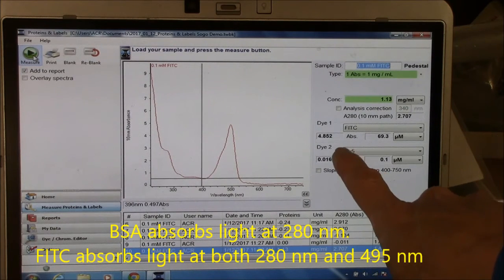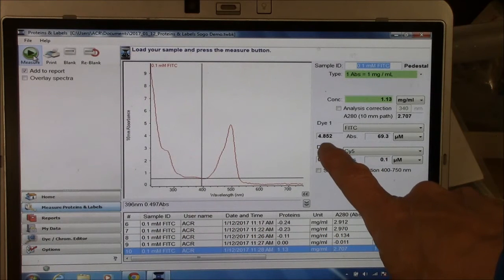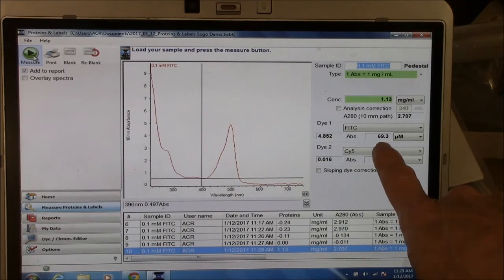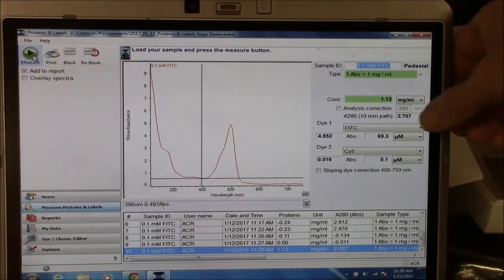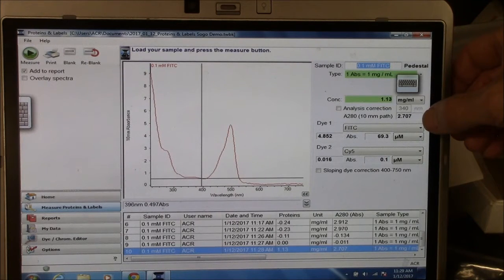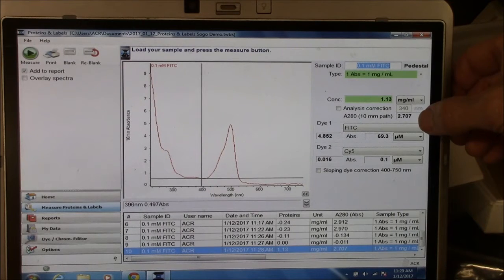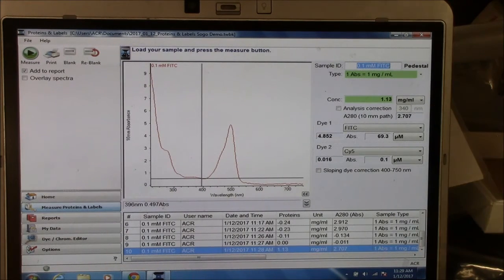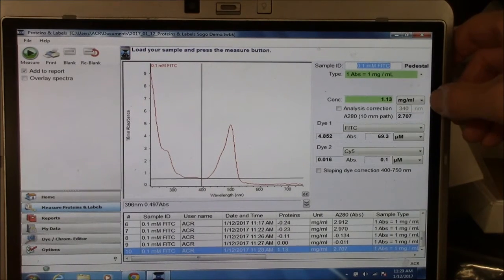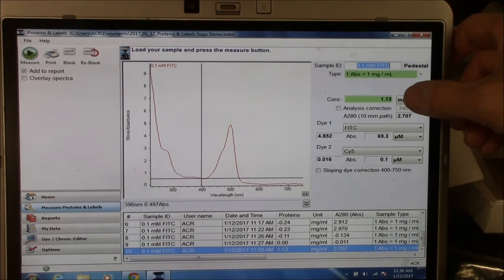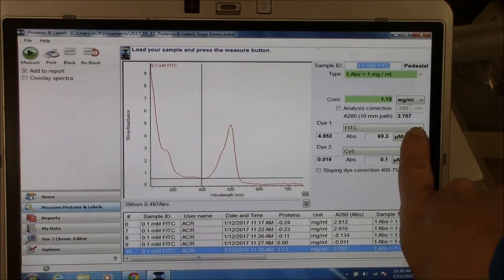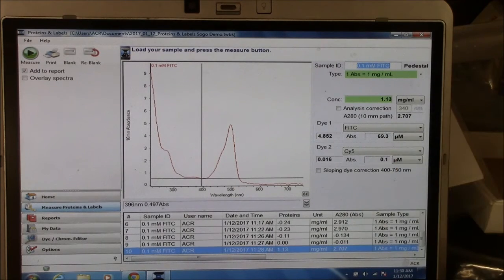It is telling me here that the absorbance at 495 nanometers is 4.85, which corresponds to a concentration of about 70 micromolar fluorescein. It's telling me here that the absorbance at 280 is 2.71. Some of this absorbance is due to the fluorescein, the FITC, and some of this absorbance is due to the protein itself. The computer is suggesting that the concentration of the protein is 1.1 mg per mil. Now, that is not the truth, but it's close to the truth. It's really saying that the absorbance at 280 nanometers is 1.1 after we subtract out the contribution of FITC to this absorbance at 280 nanometers. I will show you that on paper.